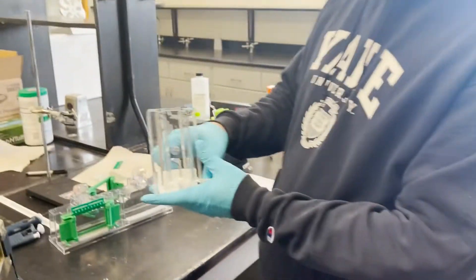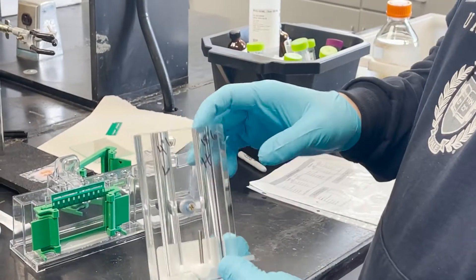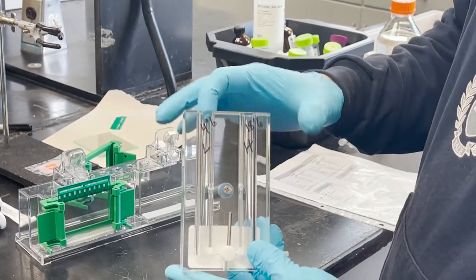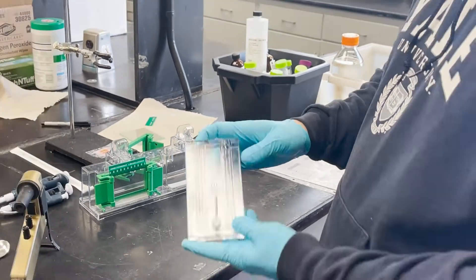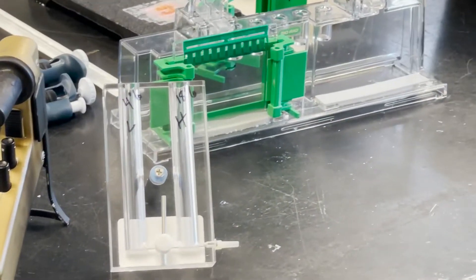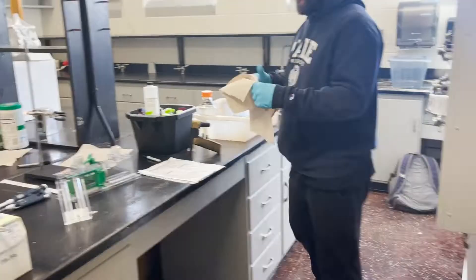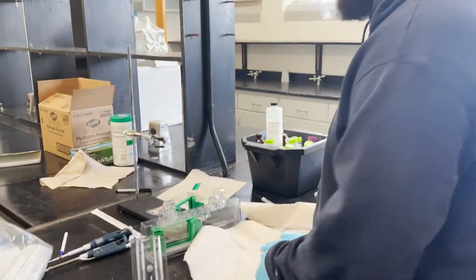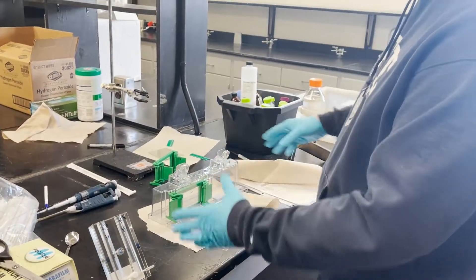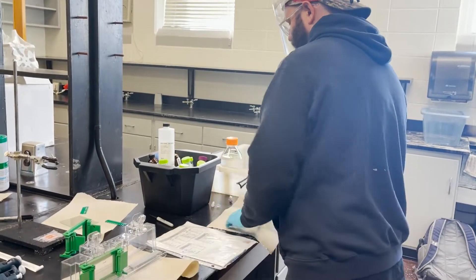We're going to do a gradient gel, which means the bottom of the gel is going to be heavy with acrylamide and the top part is going to be light with acrylamide. I'm going to demonstrate how to pour a gradient gel. Take the comb out and mix up our solutions. The acrylamide is toxic — you don't want acrylamide all over your space, so put some paper towels down in case it leaks.